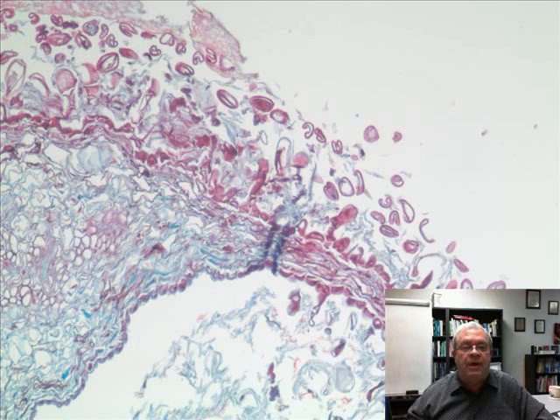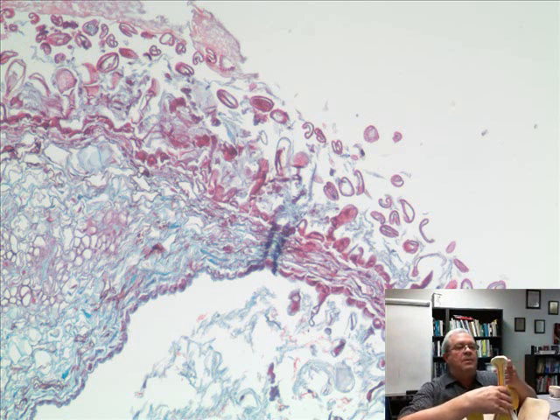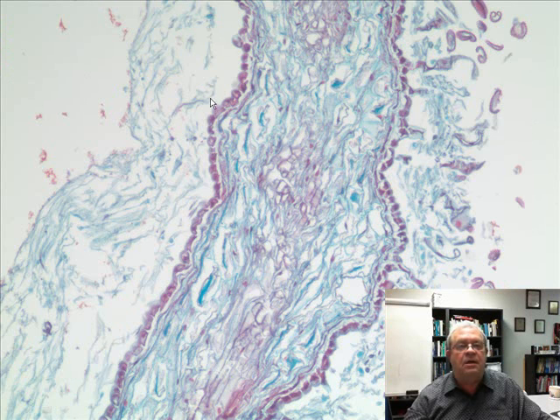And what do we have here? We're now coming around the right side. We're coming around the bend, so to speak, around the top and down the right side of the stigma. It's hollow inside the stigma. What are all these things down in here in the hollow section, the hollow part of the stigma? They are pollen tubes growing from these pollen grains. Each pollen grain sends a pollen tube on south.